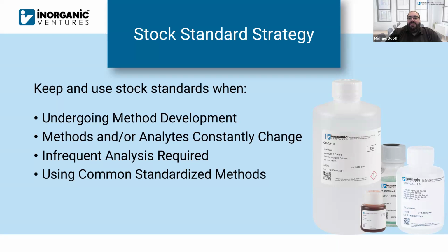for these different applications. Also, if you're a lab that doesn't do ICP analysis very frequently, there are labs that run the ICP once a week or once every other week. They'll batch up samples, and they don't run the ICP every day. It's a very infrequent test for that location. So in that case, typically folks will go with stock standards on that approach as well.